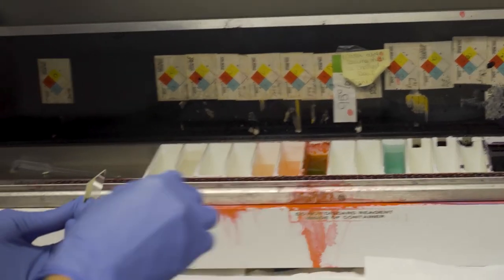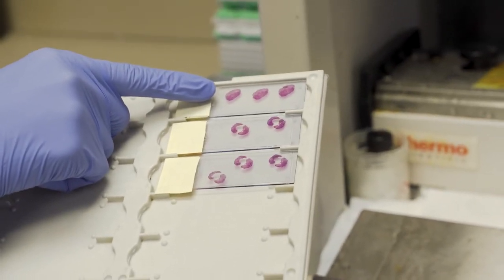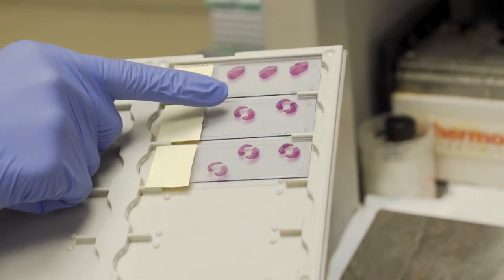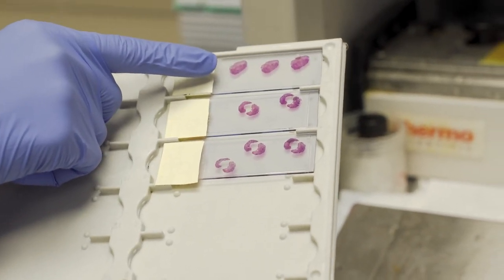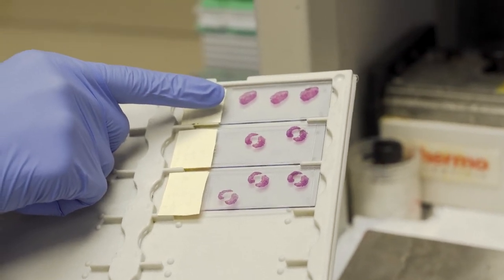Once it's done we then have slides like this where you can see this is the first stage of Mohs. In this case the edges were still positive so we had to go back for a second stage, and then you can see after this stage the patient was clear. The ink creates these purple and pink colors that allow me to tell what is skin cancer and what is not under the microscope.